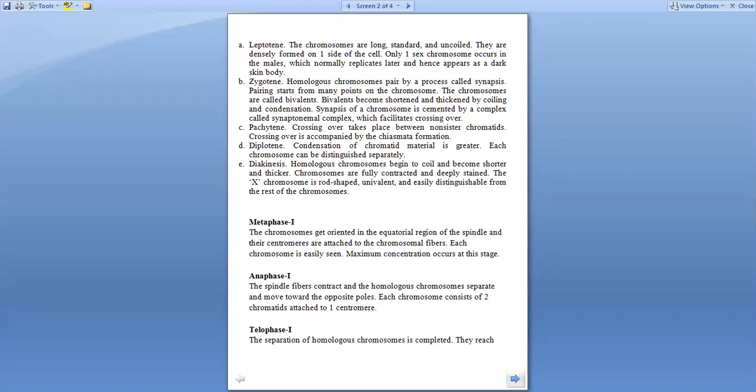Prophase consists of prophase I with substages: leptotene, zygotene, pachytene, diplotene, and diakinesis. In leptotene, the chromosomes are long, slender, and uncoiled. Only one sex chromosome appears in males, which replicates later and appears as a dark staining body. In zygotene, synapsis starts—that is the process of pairing—and at many points they become cemented by a synaptonemal complex. This facilitates crossing over. At this stage the chromosomes are bivalent.